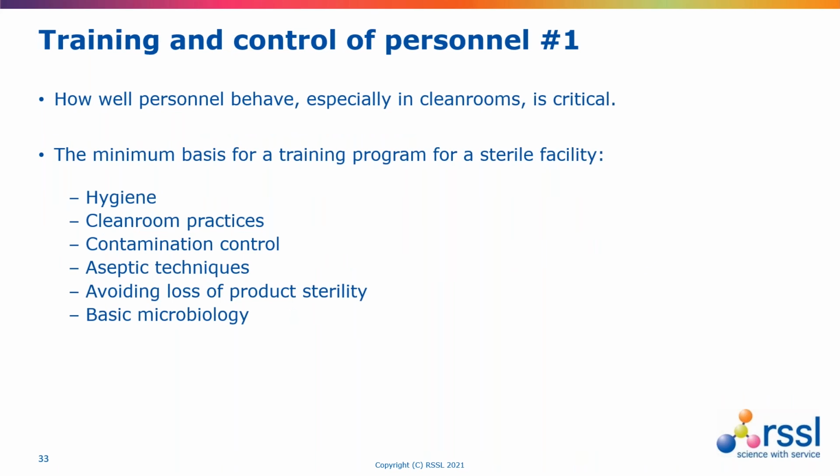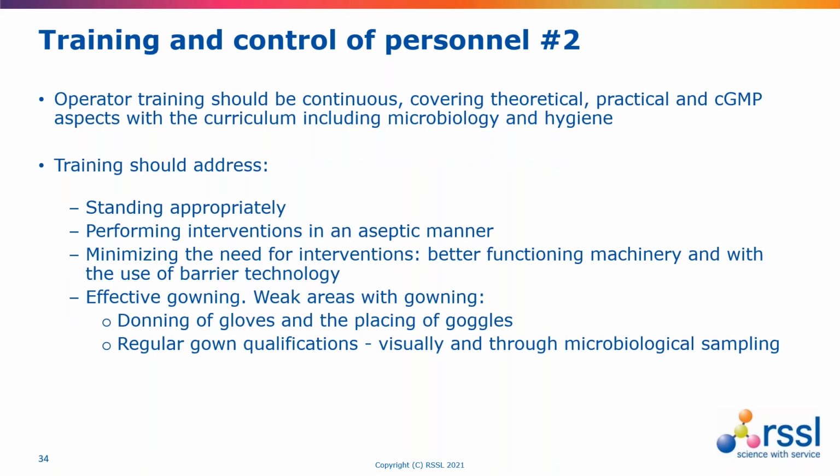And the contamination control strategy also needs to consider the training of people. And there's an important emphasis placed within Annex 1 on people having the appropriate knowledge and understanding to do their jobs. And people going into clean rooms should understand hygiene, basic microbiology, sources of particles, sources of contamination, and an understanding of aseptic technique.